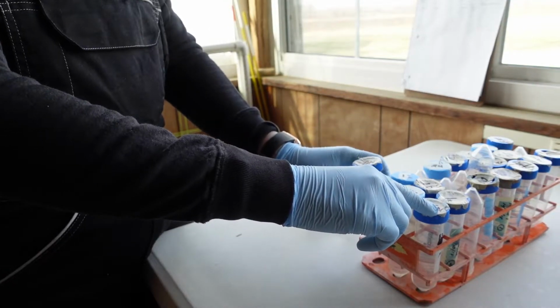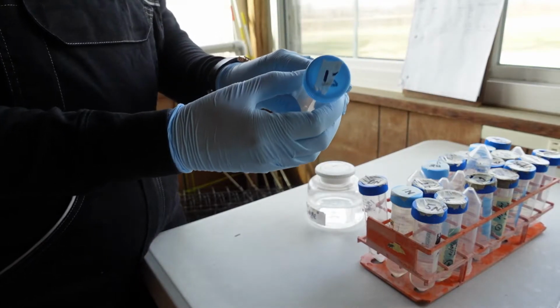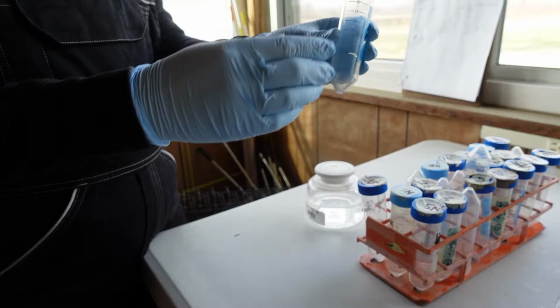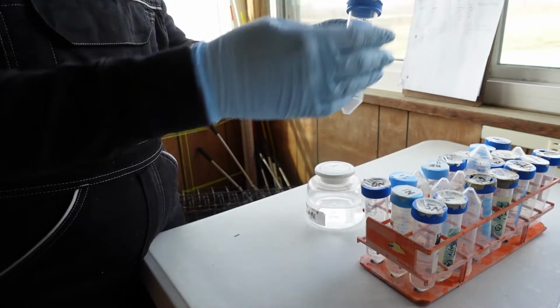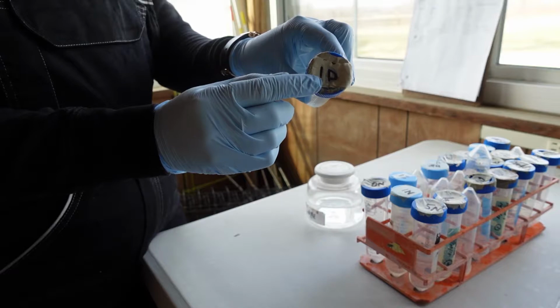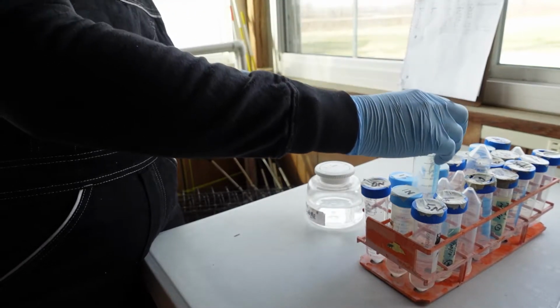The second kind of tube you will see is an empty tube with a cap that has a number on it. That's your sample tube. And it's empty because we will be filling that with the sample. All right, next, along with your samples, you'll see another empty tube. It'll have a number and then a D. So this one says 1D. That means a duplicate sample for sample number 1.